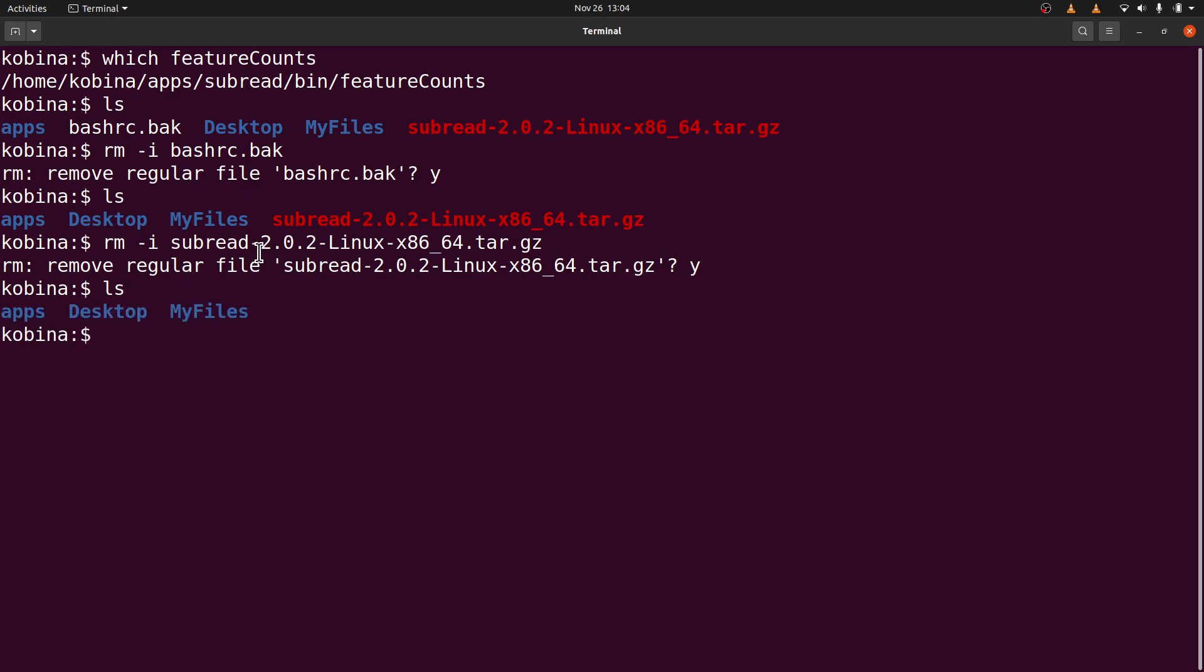This is it. So this is how we install and then set up featureCounts. So now that you have installed and set up featureCounts, it's important you also watch this video which shows you how to quantify RNA-seq data.